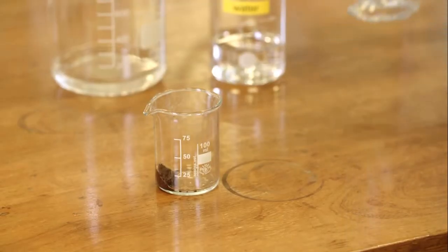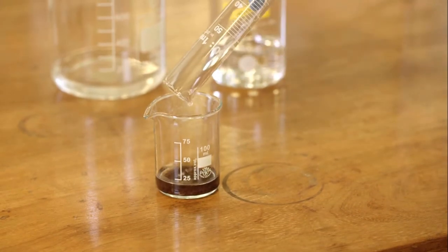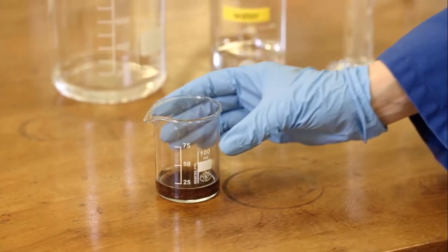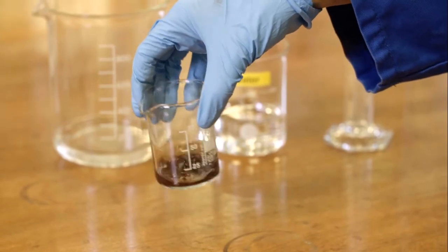The copper is now rinsed with 10 centimeters cubed of distilled water and stirred. Rinsing with the water removes any zinc chloride present.